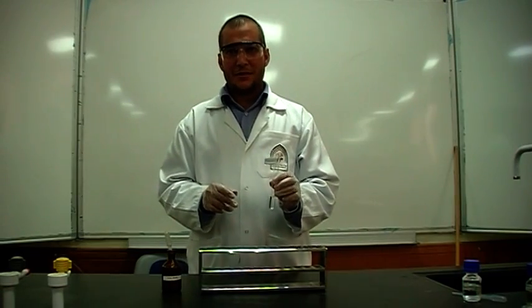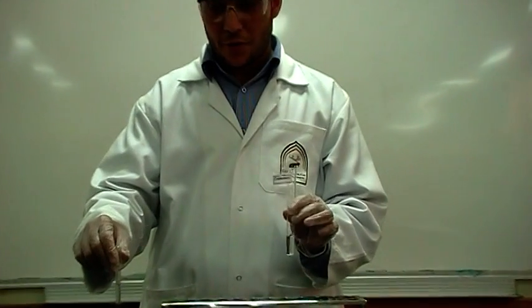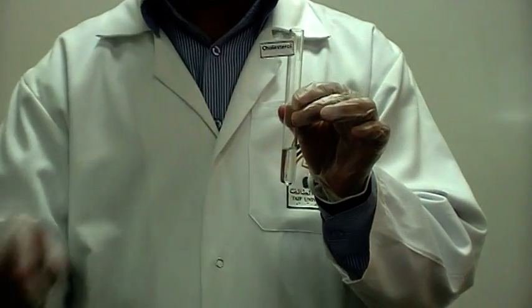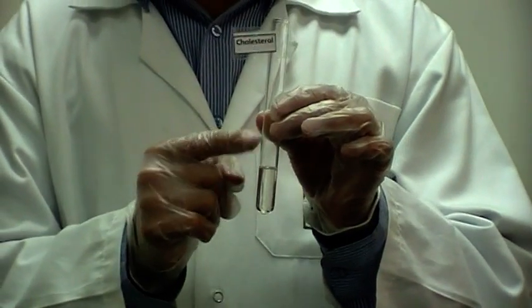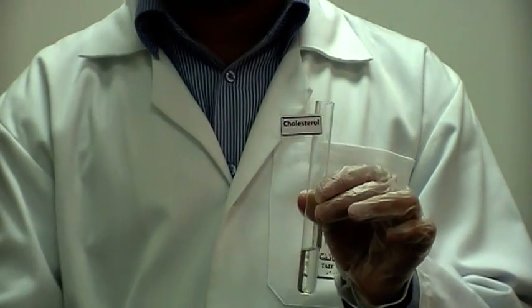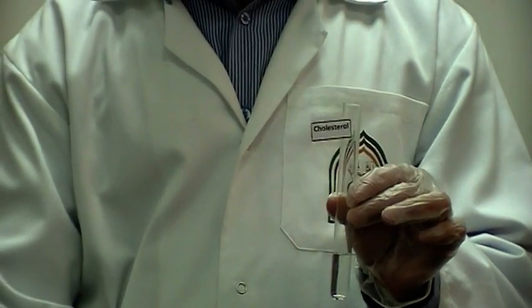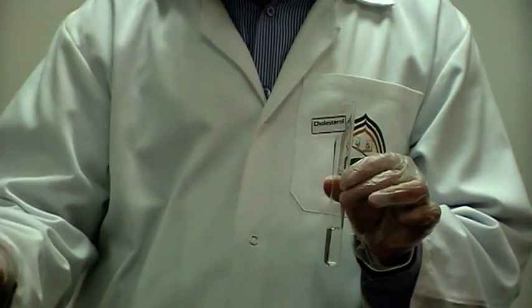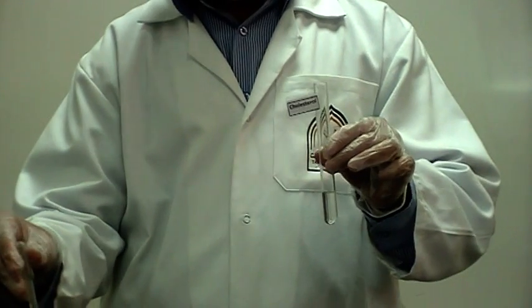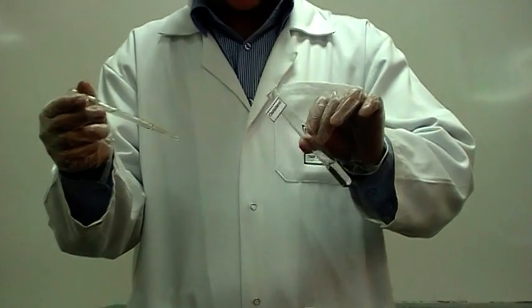Let's do some Salkowski experiments, which is specific to cholesterol. We have chloroform with cholesterol diluted and dissolved in it, and we have concentrated sulfuric acid — very, very dangerous. So that's around 1–2 ml of sulfuric acid added to the chloroformic extract of cholesterol.